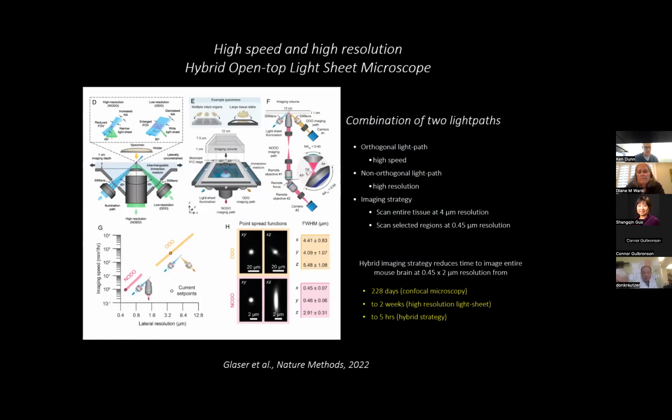So in the way that this works, this is the conventional light path. You've got a light sheet penetrating through here. You're imaging here, very high speed. Down here, you've got another objective, and you're imaging diagonally. Essentially, you're imaging a plane that's not orthogonal to the objective, which means you're going to have to translate this diagonal image into an orthogonal one through a second focus. So you're taking this focusing and turning this into an orthogonal plane. You collect an image there. This has much higher NA, lower depth of penetration, and it takes longer to collect.